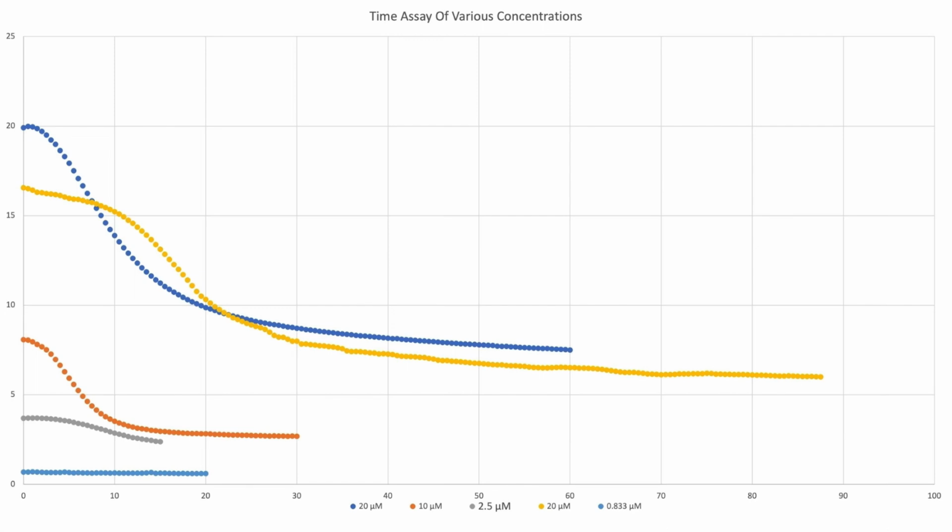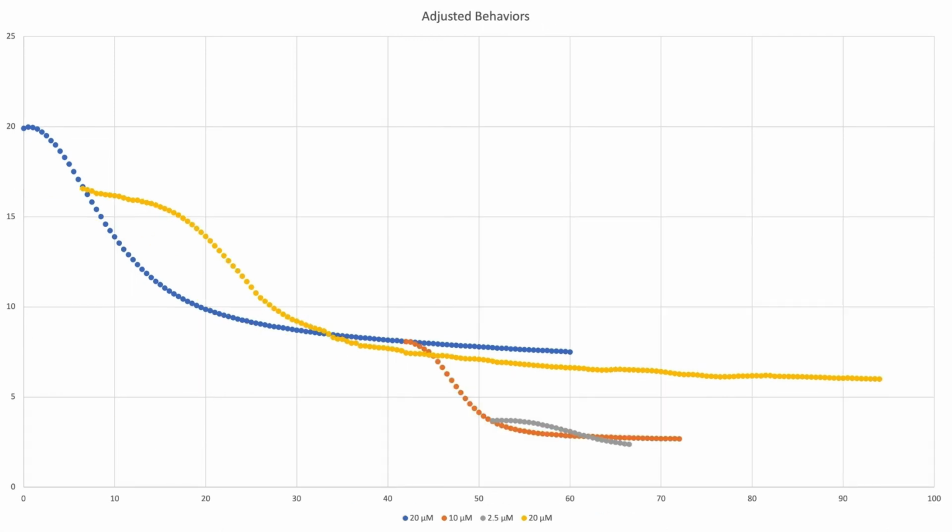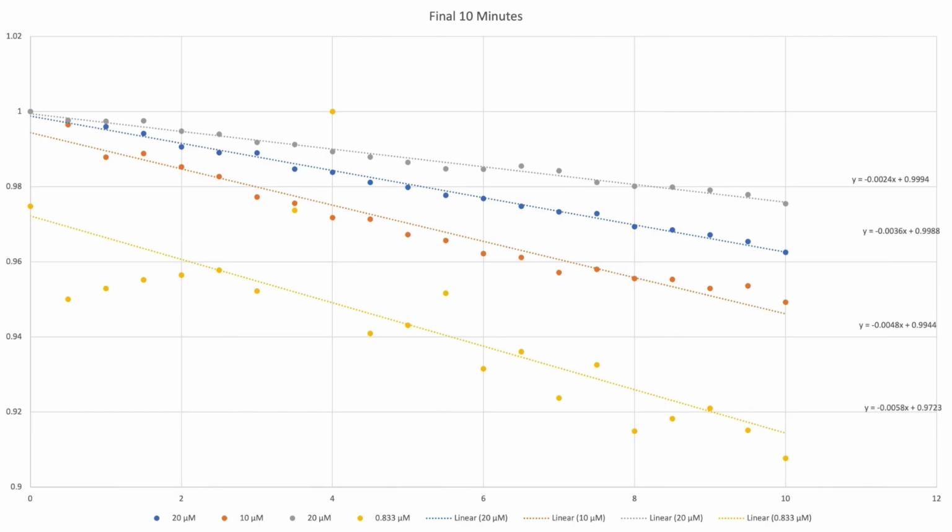These are a couple of the data that we have collected. Some mixtures drop in concentration quickly, while others take a bit longer. The property we are observing is important because it allows us to understand how quickly the compounds form structures, called aggregates. The more aggregates, the lower the concentration we observe, due to the fact that they are leaving the solution.